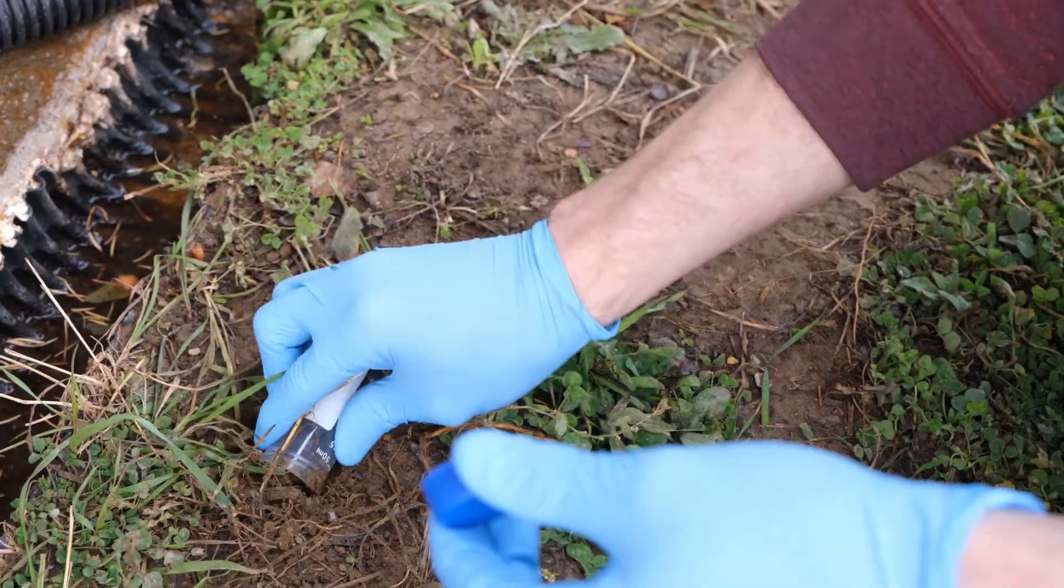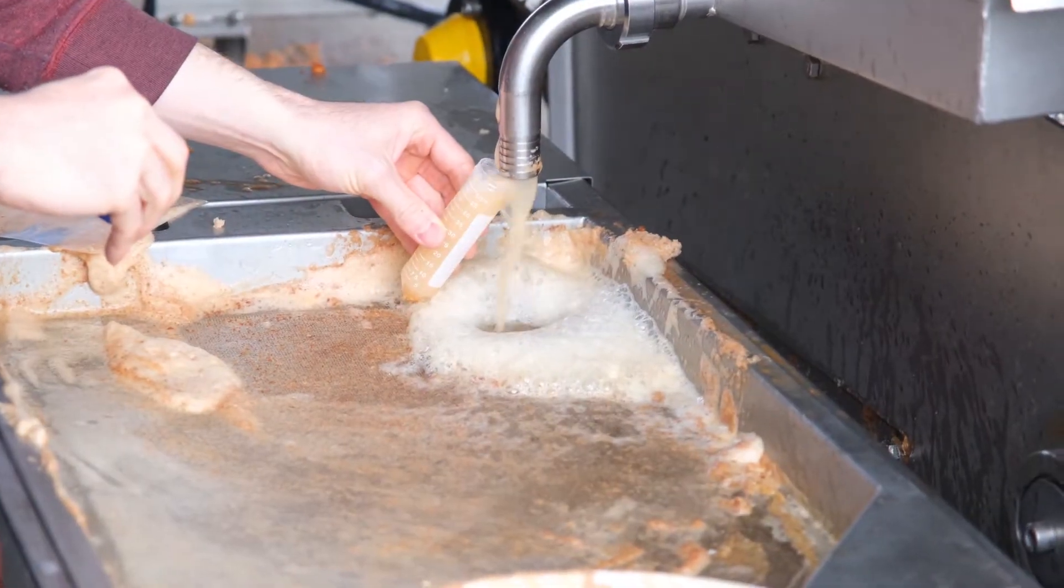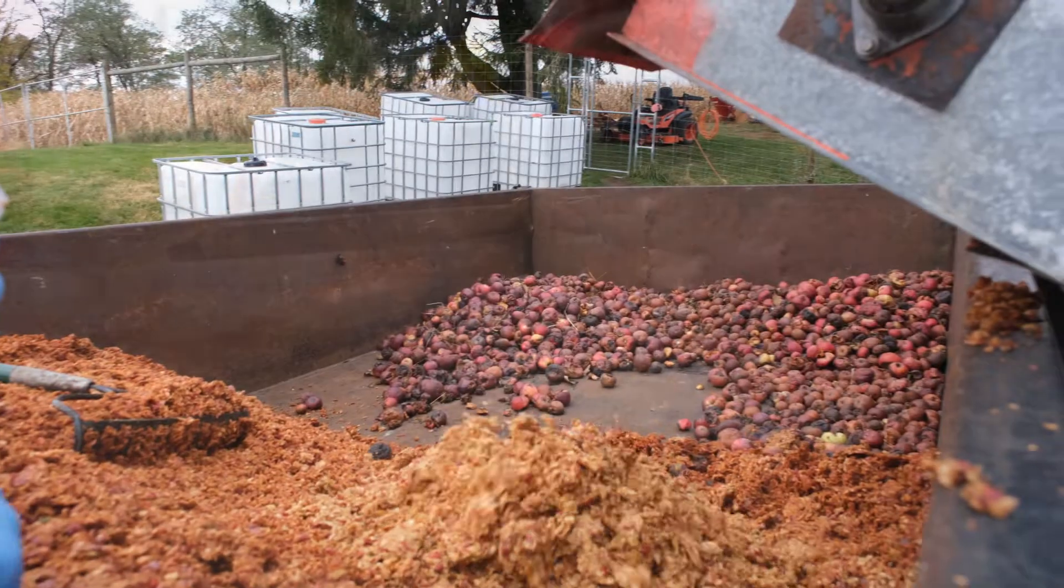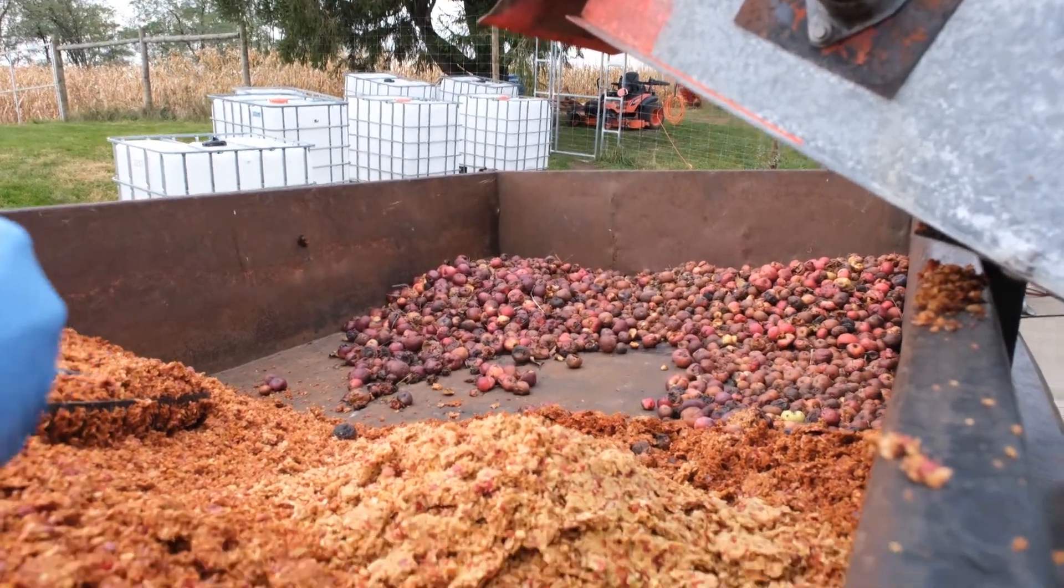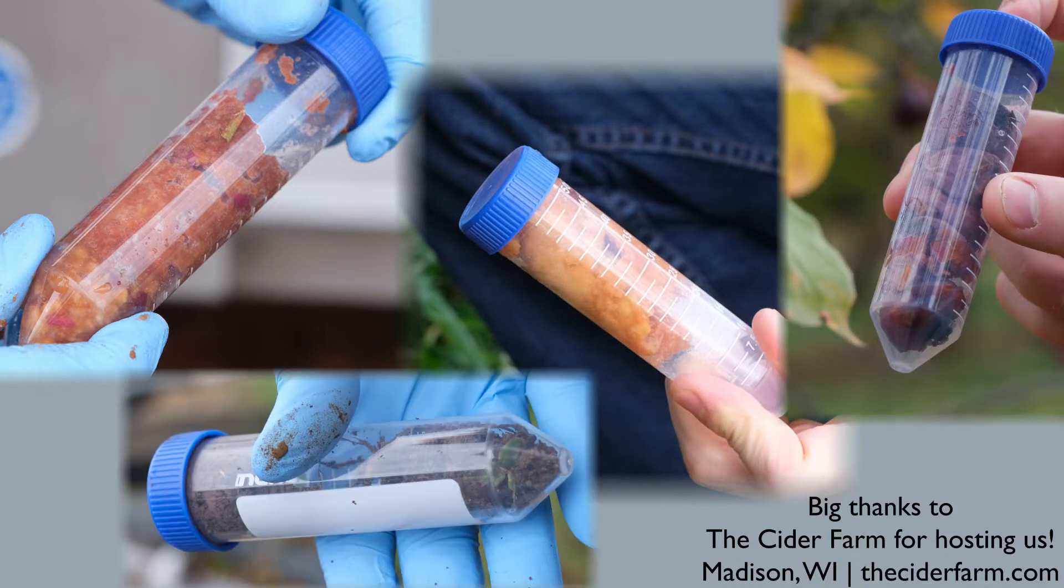Phages live inside their bacterial hosts, so we have to find the bacteria to find the phages of interest. We don't really know what microenvironment Zymomonas mobilis lives in, so we took samples of soil, fresh apples, rotten apples, pressed apples, pulped apples—we took lots of samples.